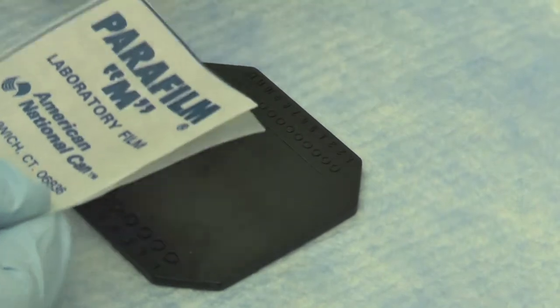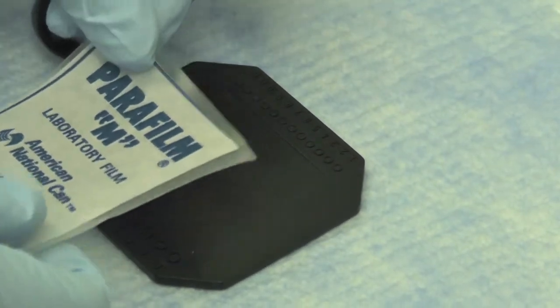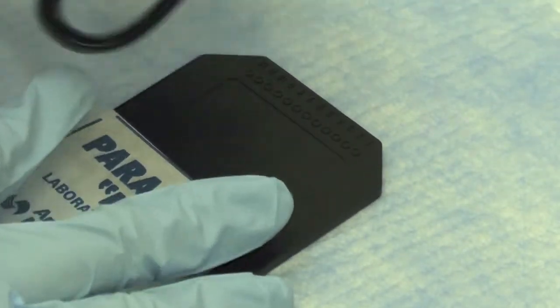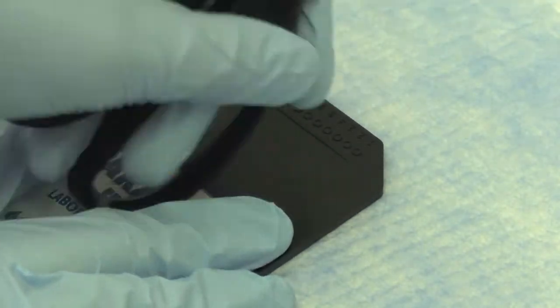Put parafilm with the wipe piece on the sample holder to cover the circles. Use the handle of a pair of scissors to press the parafilm down on the sample holder.